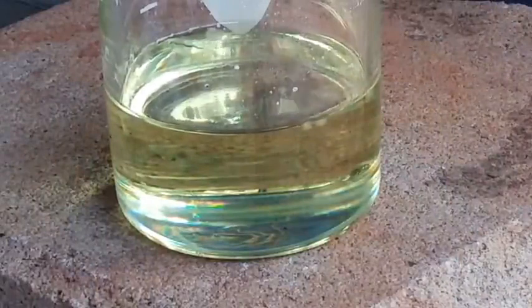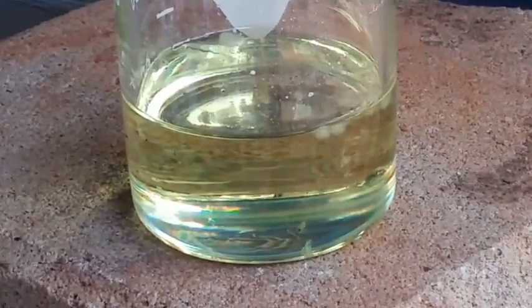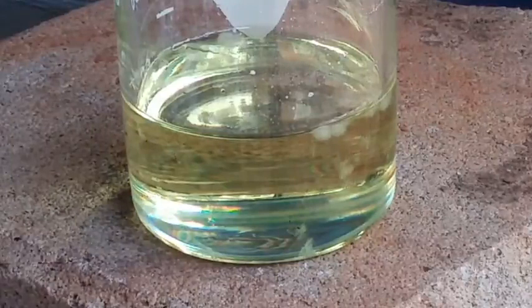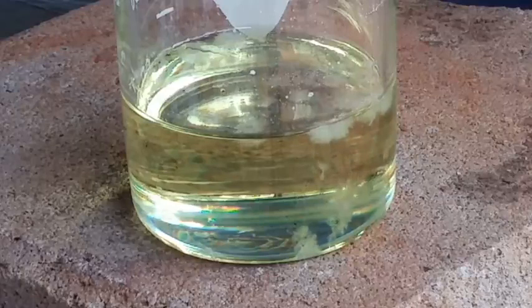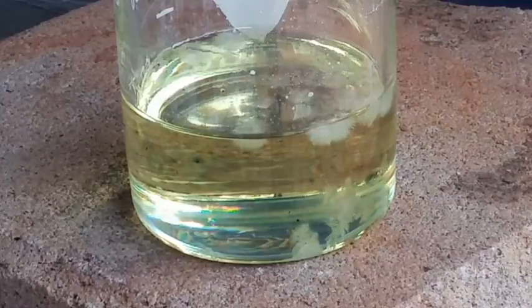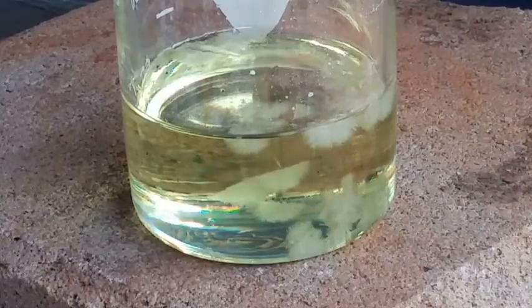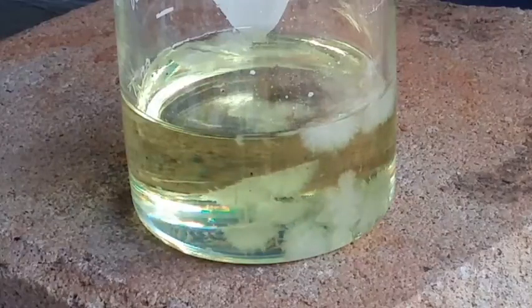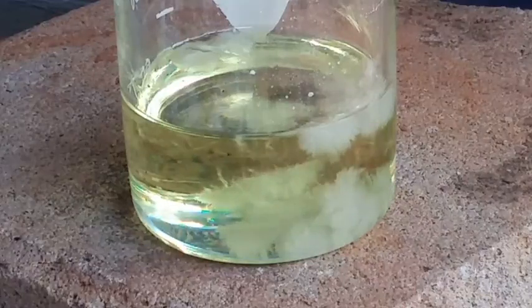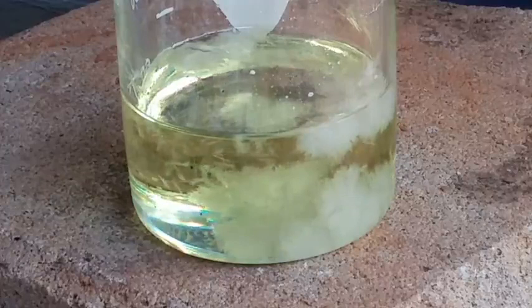Oh, here it goes. Here it goes. Yay. Look at the heat being given off by that crystallization process.